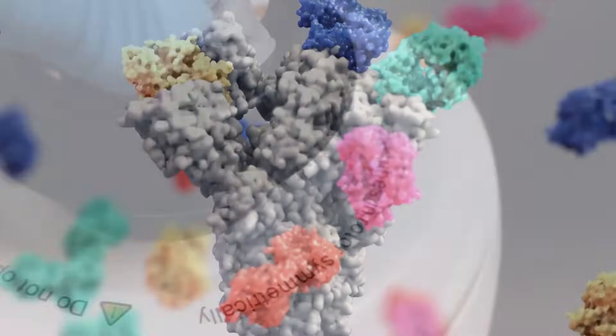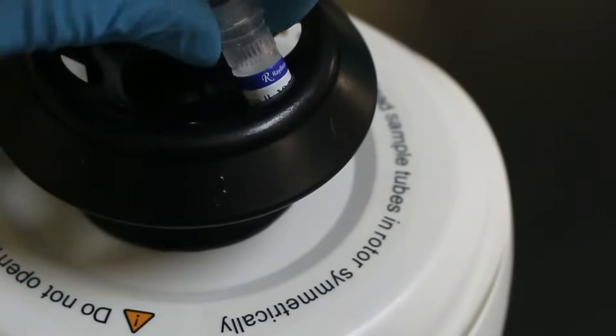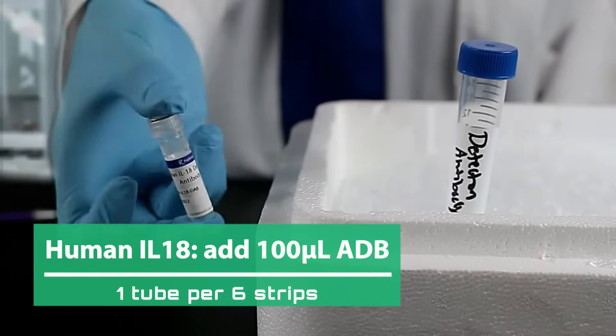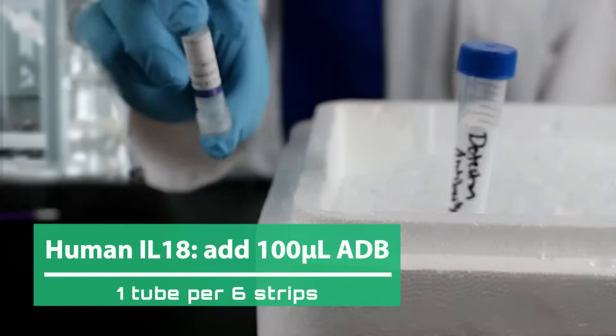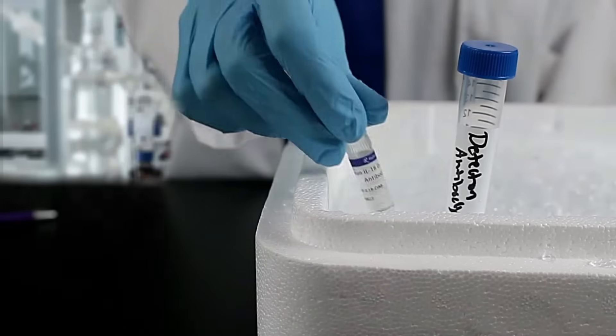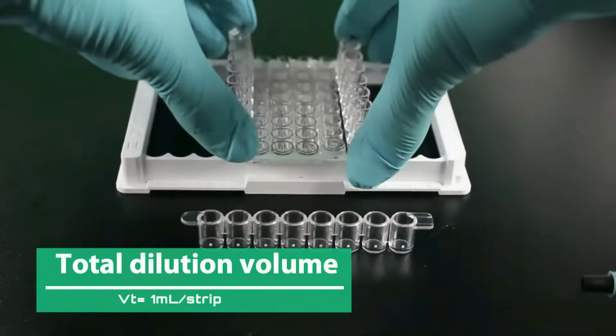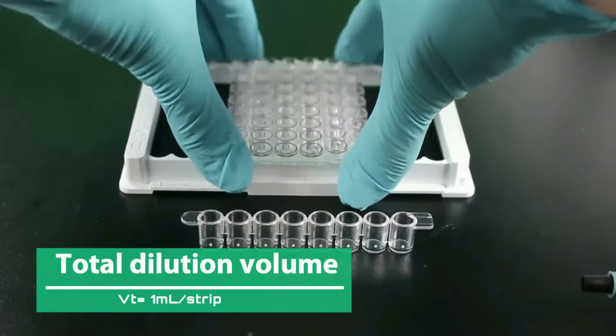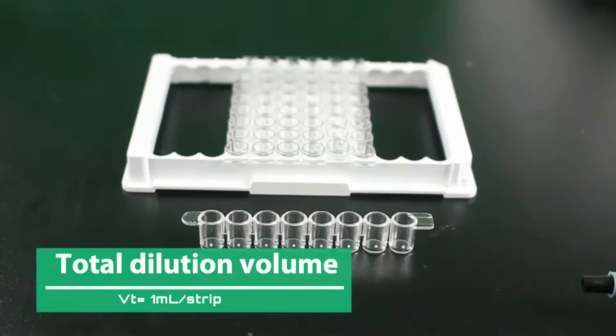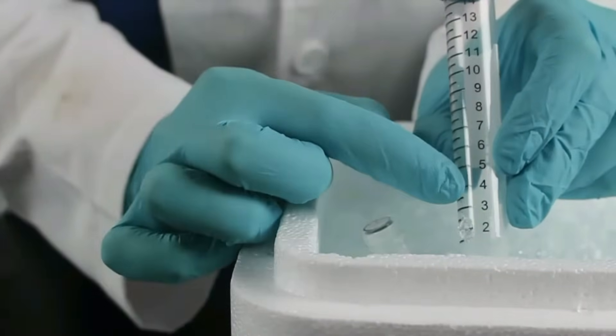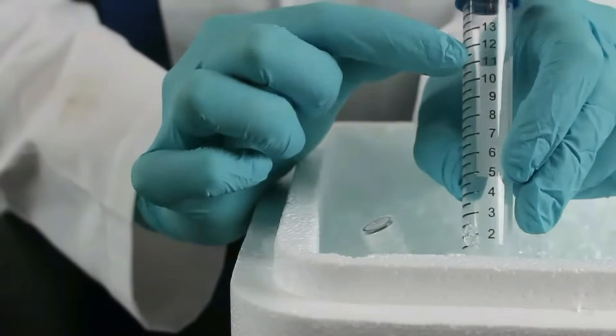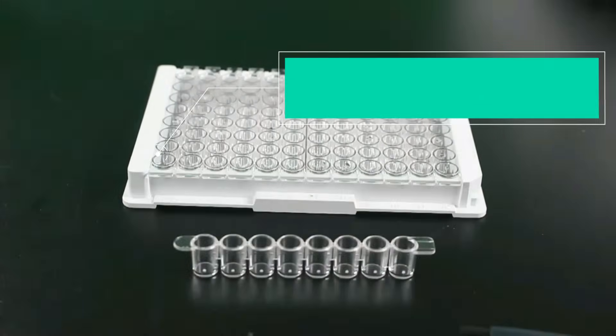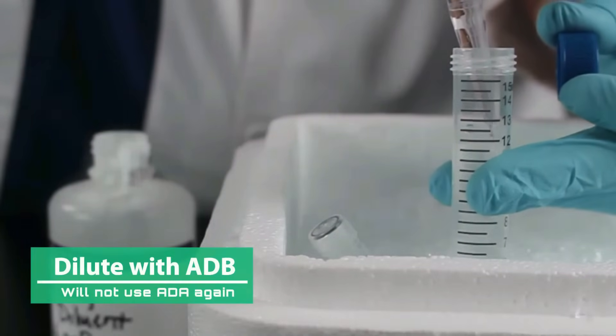To prepare the detection antibody, always spin the volume down first, then add 100 microliters of ADB to the vial. One tube is enough for six strips. We are using a full plate, so go ahead and reconstitute both. The final concentration of detection antibody is target specific, so the total volume needed for all targets is calculated as one milliliter per strip. If you are using four strips, it's four milliliters. Six strips is six milliliters and 12 strips is 12 milliliters. Because we are using a full plate, the total volume used will be 12 milliliters.